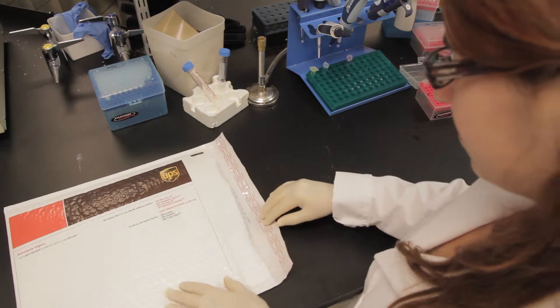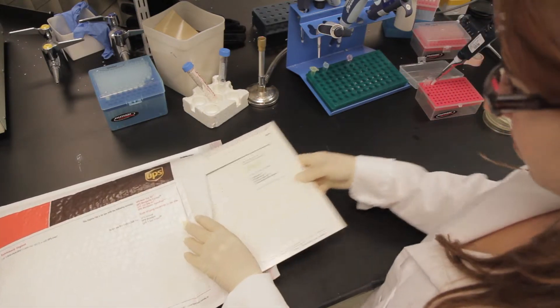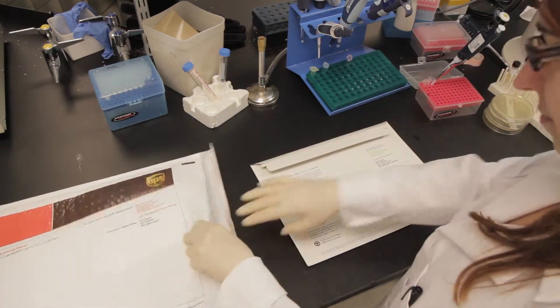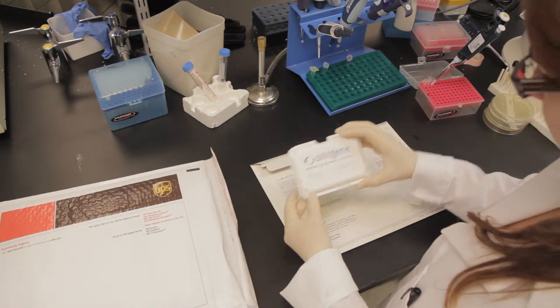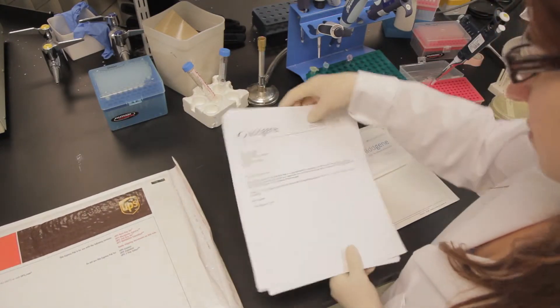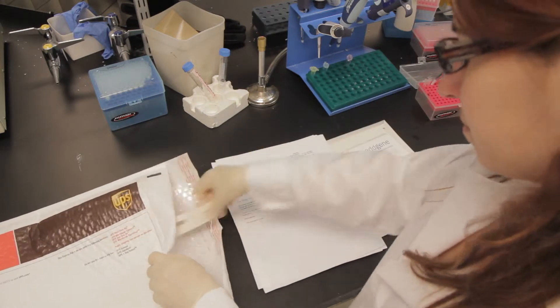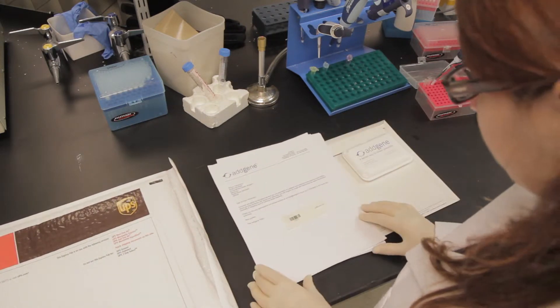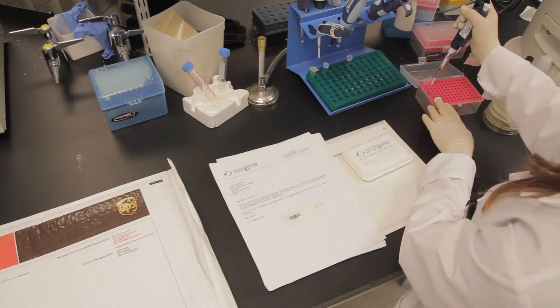Once you have entered your deposit online or requested a deposit kit, AddGene will send you a package consisting of shipping materials, a plastic shipper for returning Eppendorf tubes, any paperwork that needs to be signed or filled out, and barcoded labels if you entered your cloning data online.